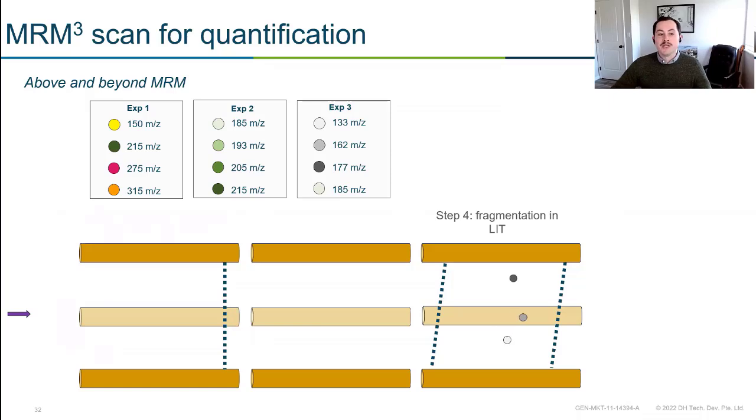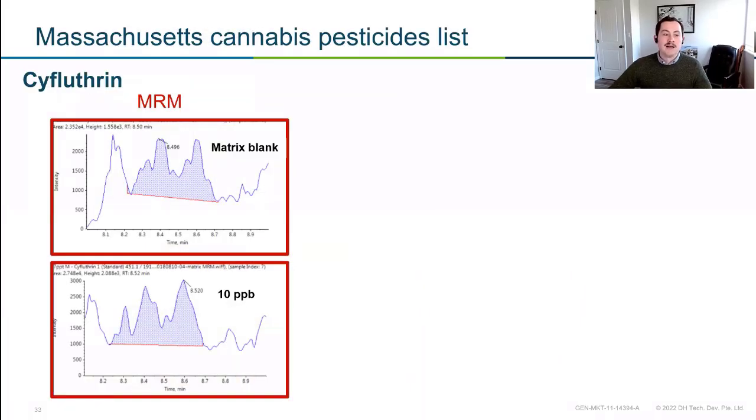So now we have the creation of these granddaughter ions. And from there, we can focus on a specific ion. So in this case, we'll look at the 133. So what type of scenario would this selectivity even be needed? Because maybe it seems like a little overkill right now. And there are two that I can think of that I use all the time.